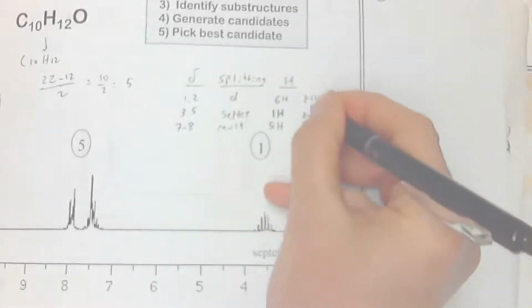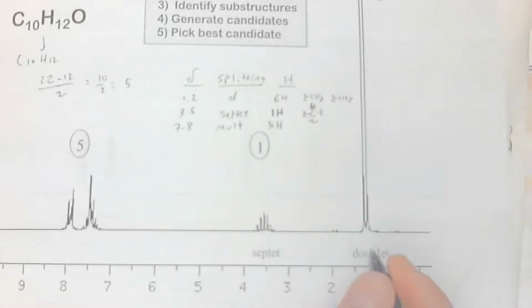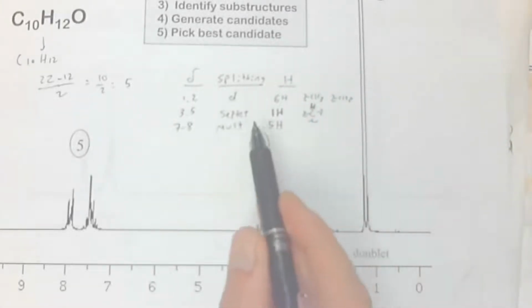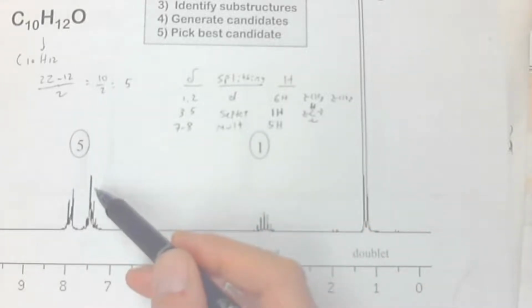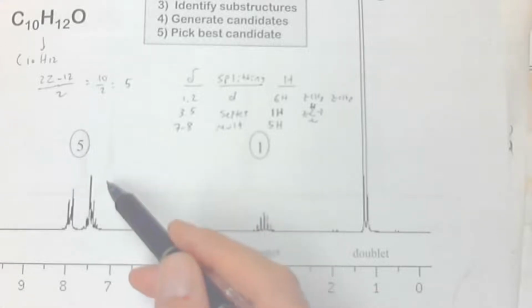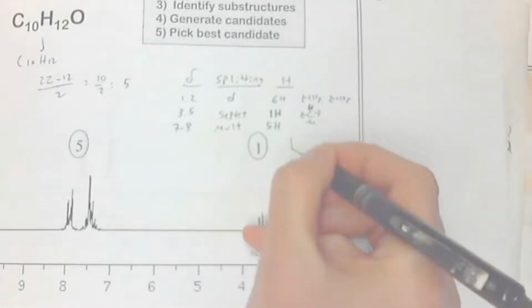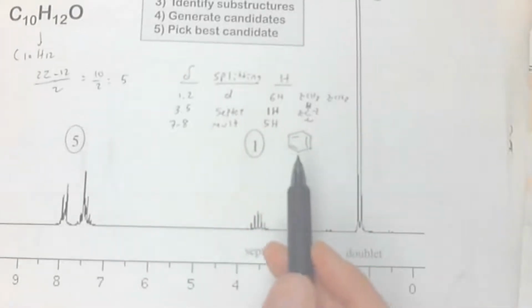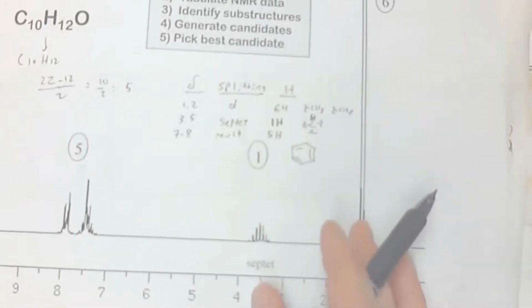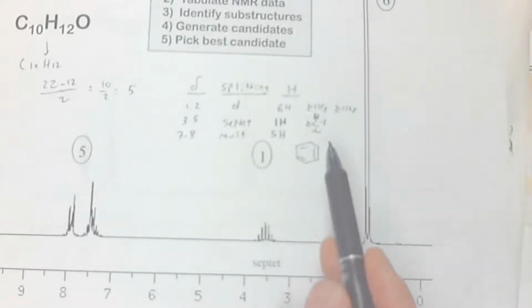So it's a CH with 3 squigglies, right? Now this crazy thing, how are we going to interpret this? Well, we said it's a benzene, right? This benzene, how many squigglies are on the benzene, meaning attachment points? And this is really important, because if you don't do that right, the problem's not going to work out. But how many attachment points?